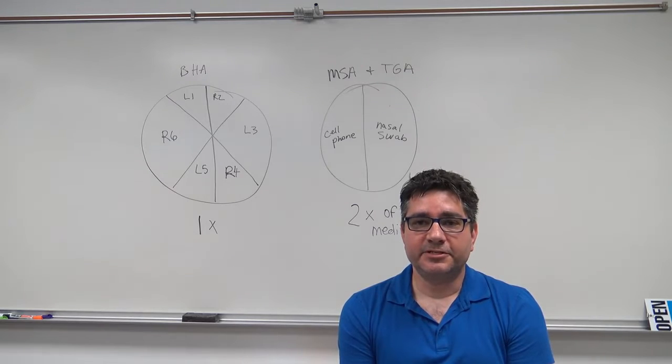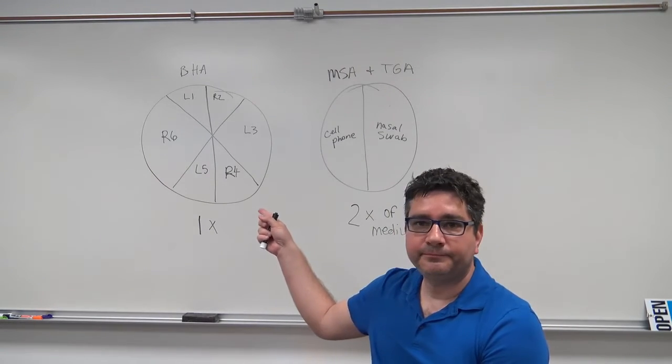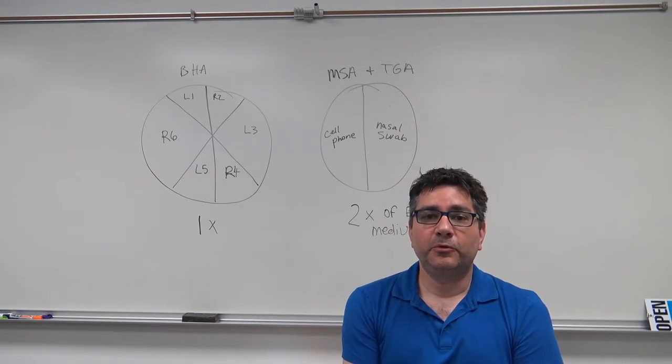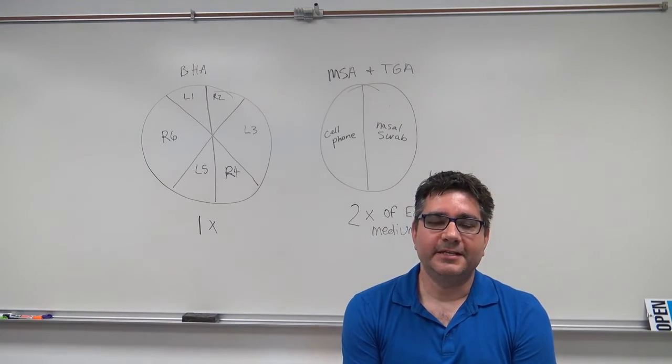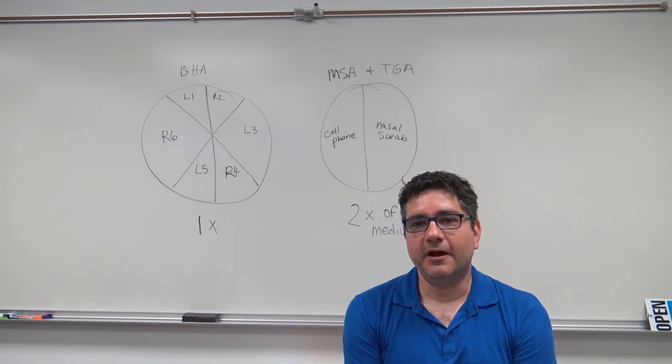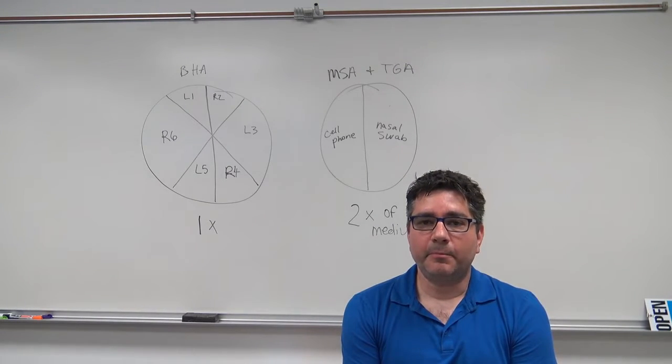To conduct this procedure, divide your brain-heart plate into 6 sections as drawn out on the board. Your partner will turn on the water and handle the plate for you while you conduct each wash and place your finger on each of the sections of the plate. Use the sterile paper towels to dry your hands after each wash. Your partner will supply you with this.